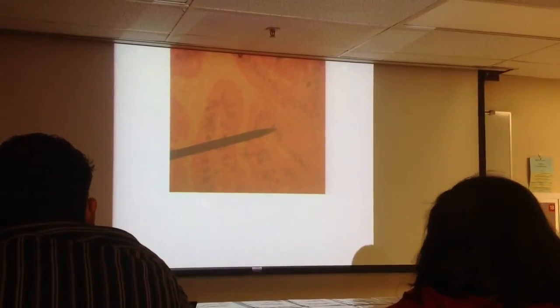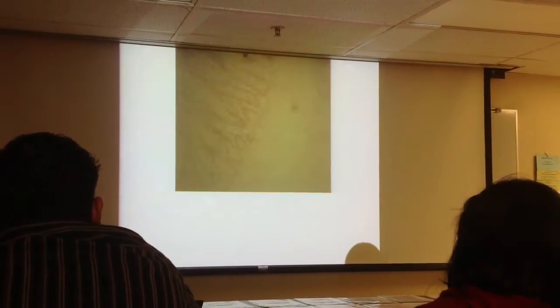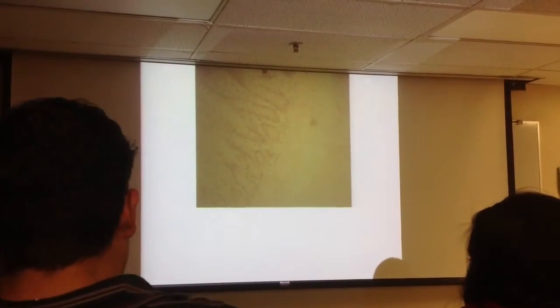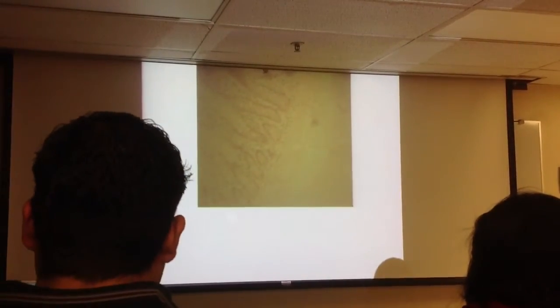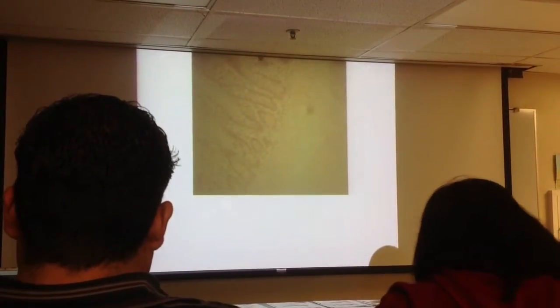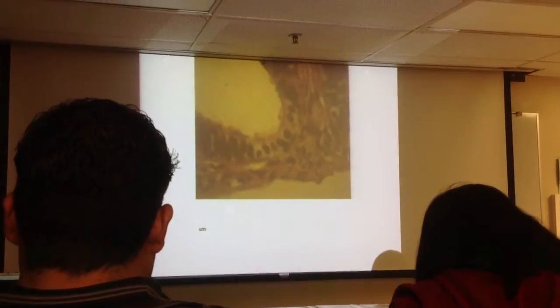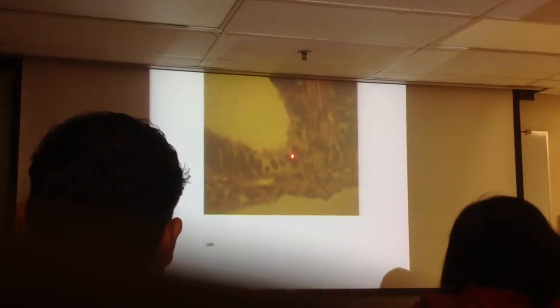There is a clear cell. What are the clear cells called when they are there? Goblet cells. And remember, you can see a lot of them here. Each individual goblet cell is a single mucus-secreting gland, so it's its own gland. Remember glands: the simple cuboidal, we have sweat glands, stratified, and then the thyroid gland, and then here we've got individual cells making the glands. Two types.